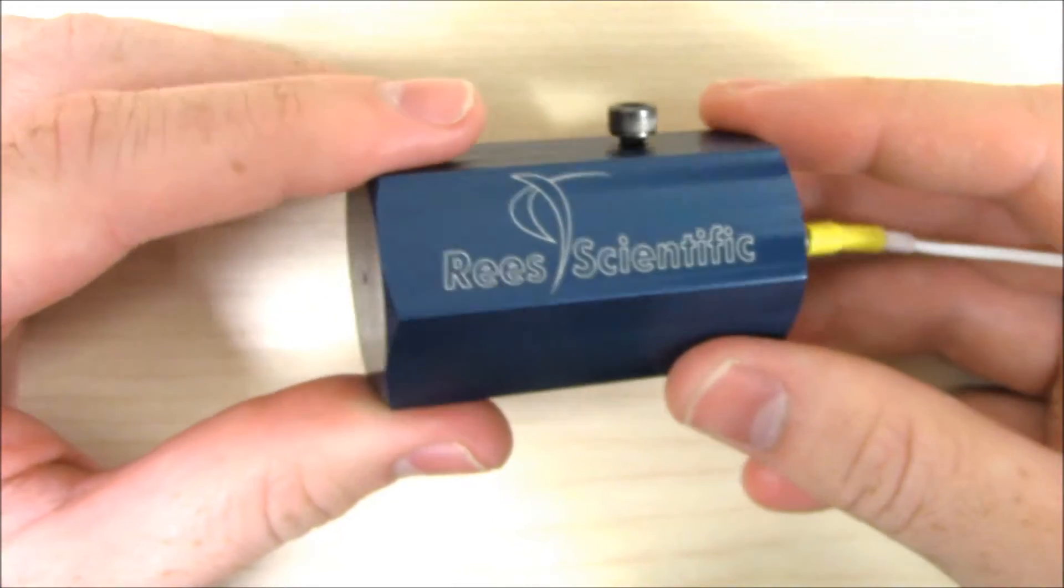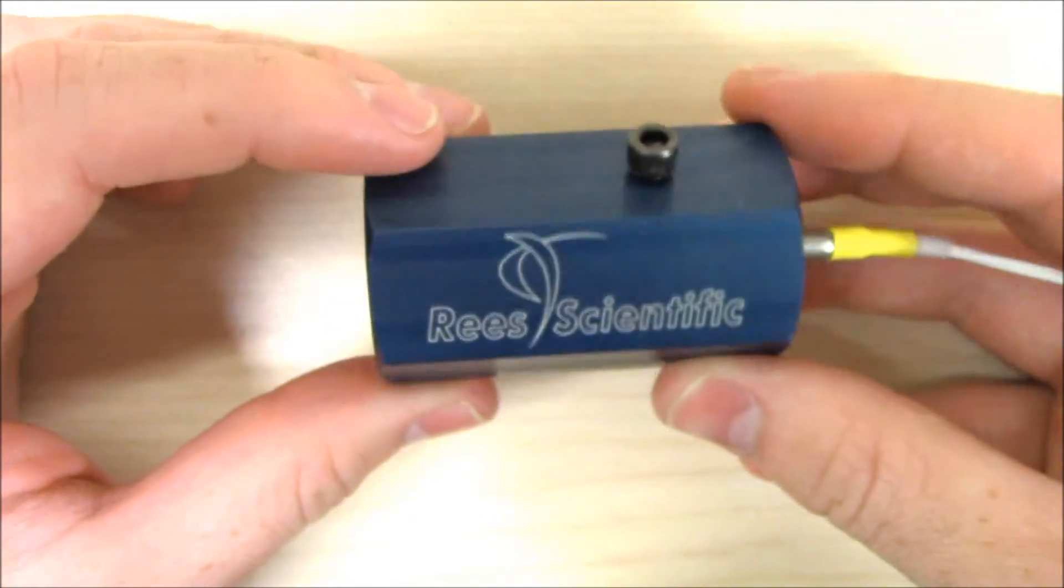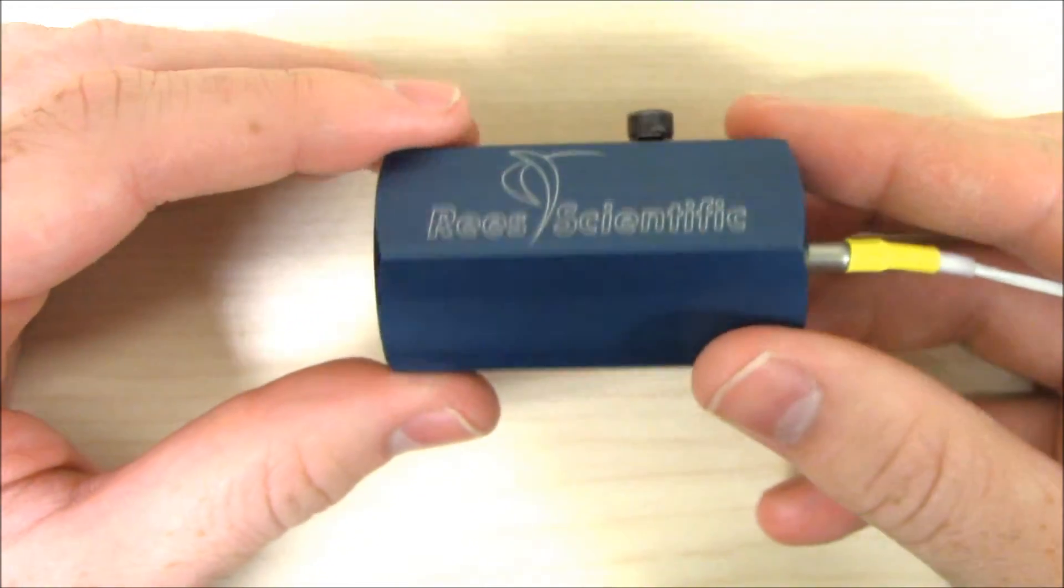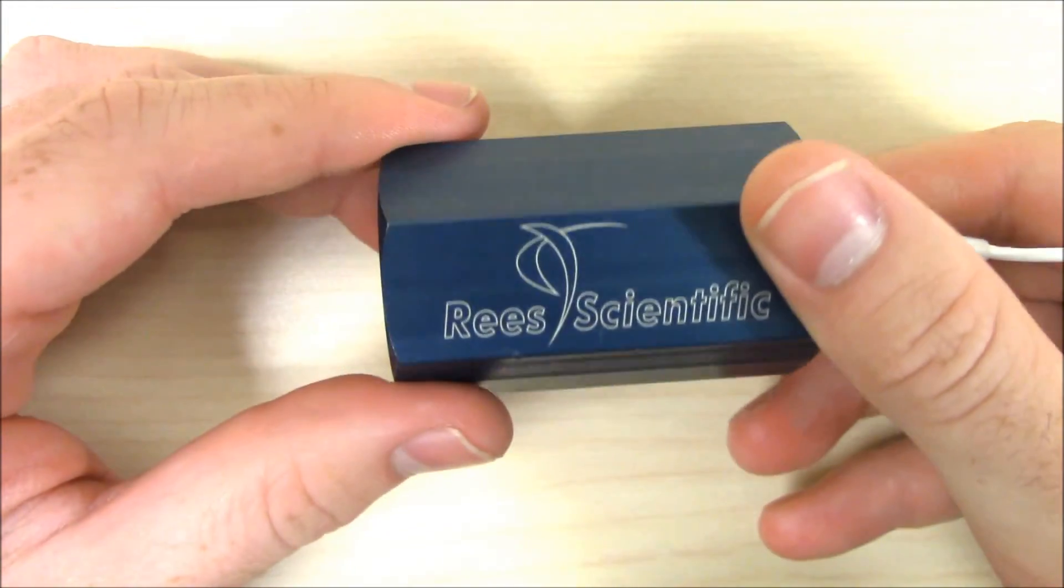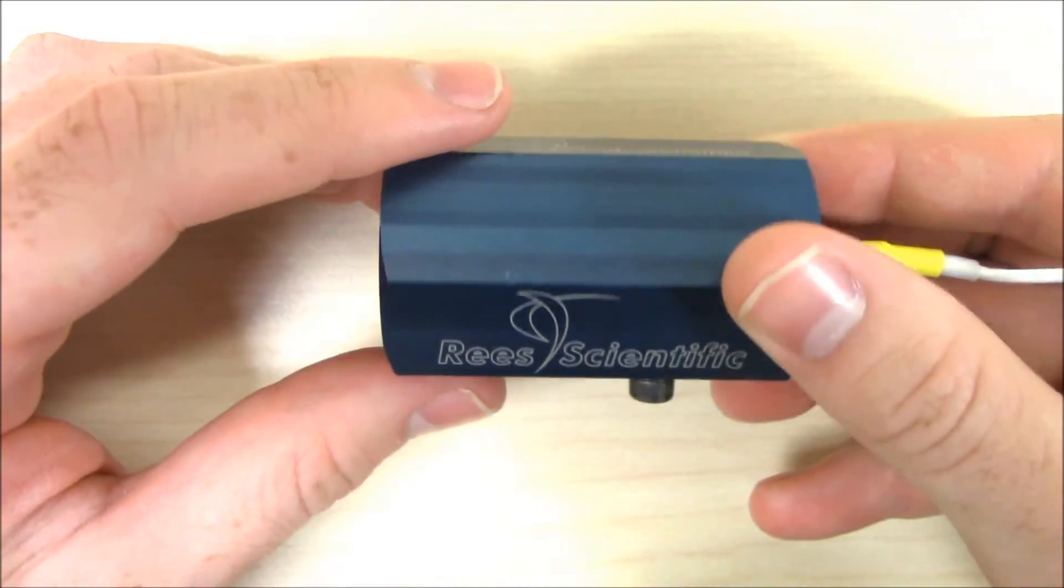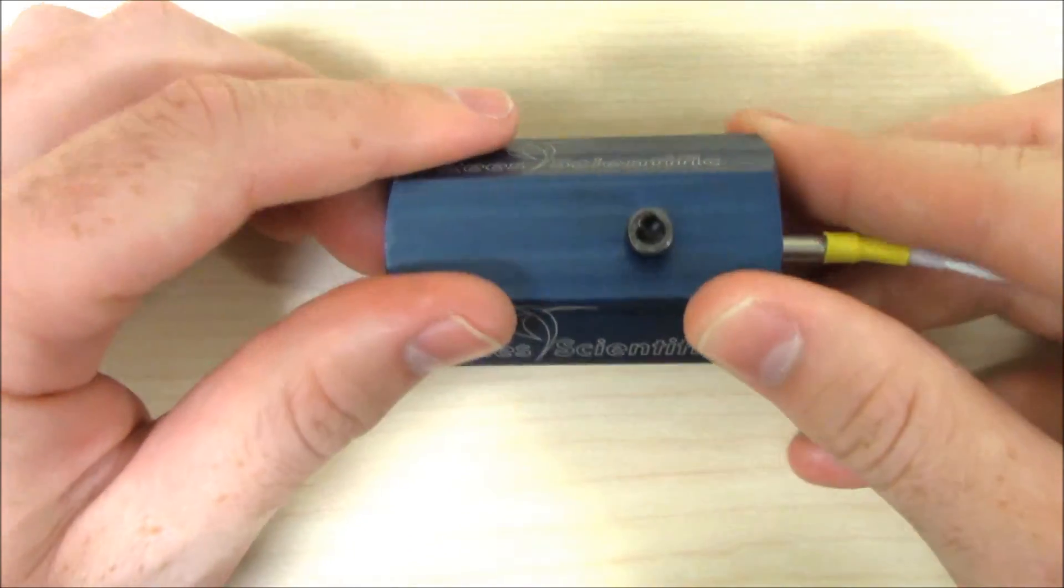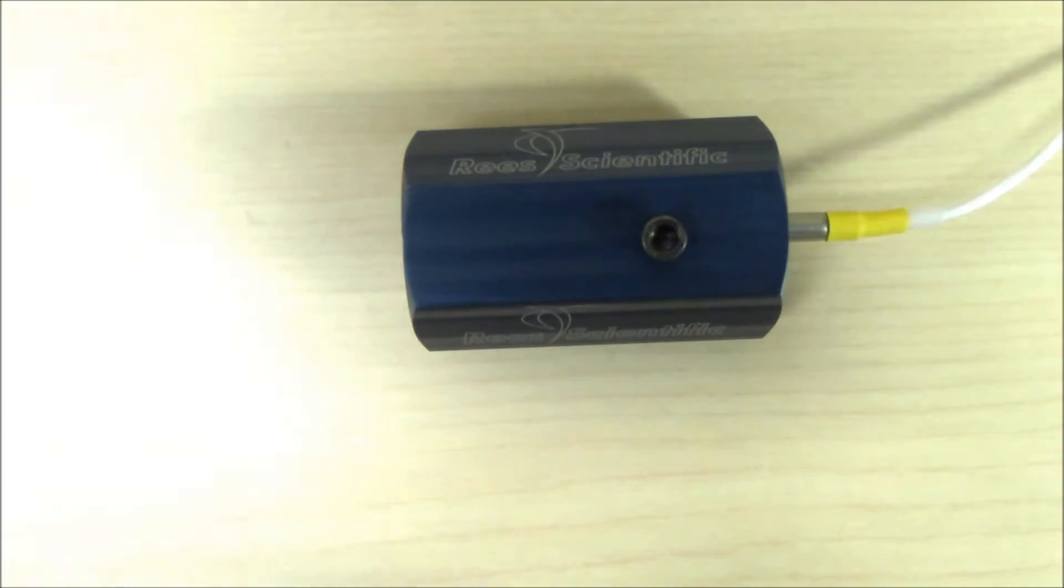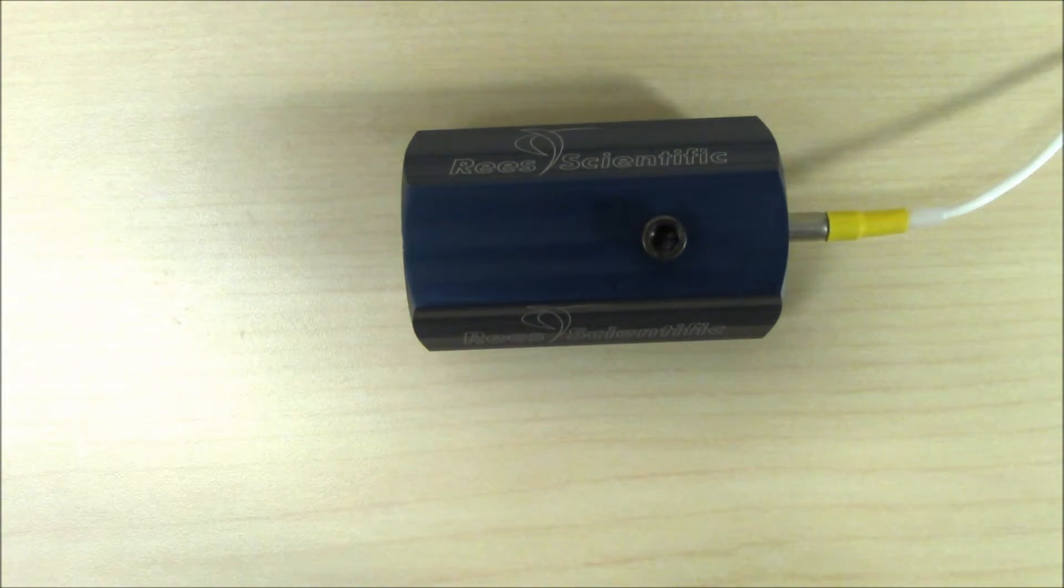The ReScientific Temperature Block is a great alternative to other methods that run the risk of spillage and contamination such as sand or glycol. These blocks can also be used in a wider range of environments including equipment like minus 80 degree freezers.